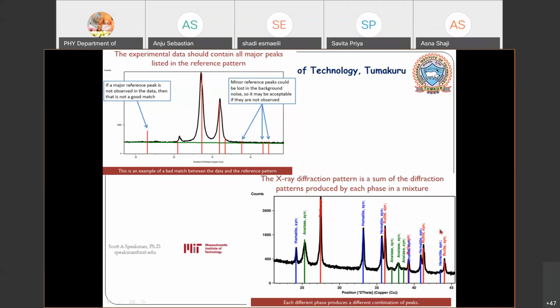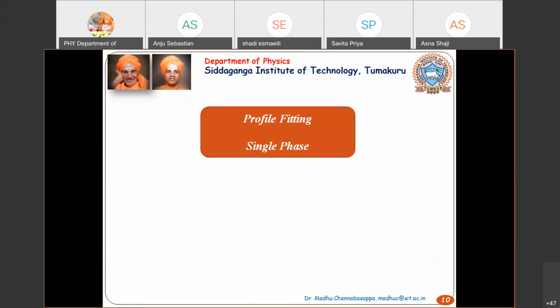Then what I will do is I will go for the main topic for today's session, which is your Rietveld refinement. Okay. So I think I have some. If there is some question, I will check it. Okay. Why change the zero from 0 to 1 in PCR file during the profile matching? Is it necessary for all materials? Yes, this is if you have to change your zero from 0 to 1.